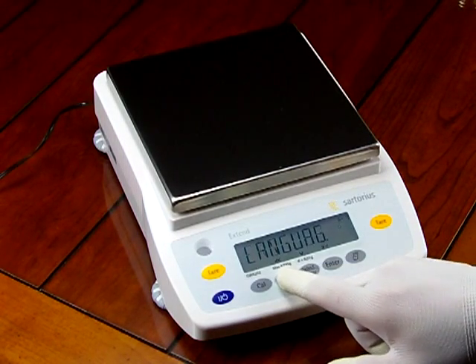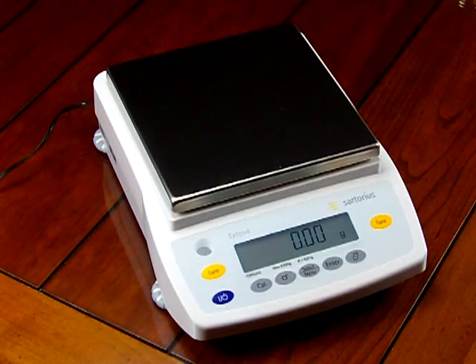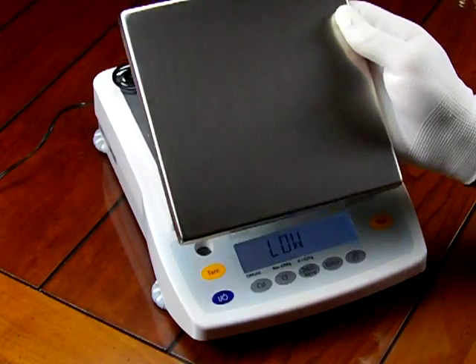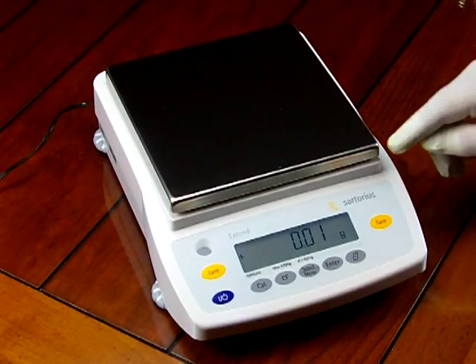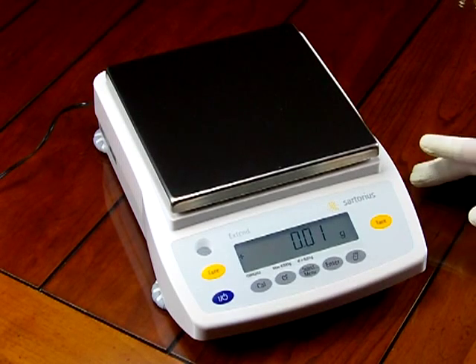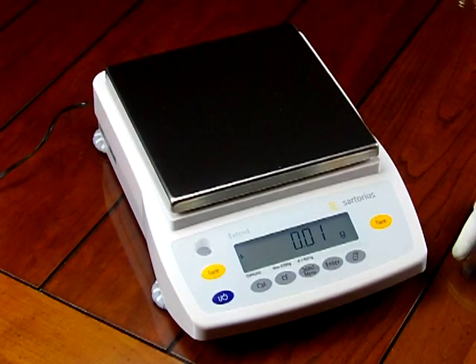The balance has a lot of features. Some other features about the Sartorius GW6202: it offers a 7.1 by 7.1 inch square weighing platform. This is a nice stainless steel platform — it is removable for easy cleaning. It's real heavy duty. Some manufacturers put a windshield around the outside edge of the balance, but Sartorius' weighing technology is so spectacular they don't need it.